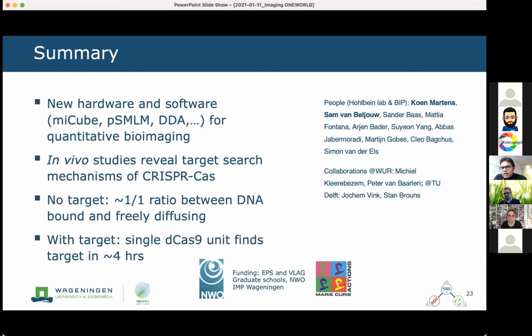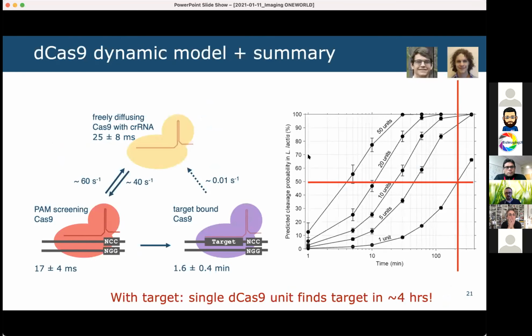Kevin Wheatley asked: you described the kinetics of dCas9 for catalytically active Cas9. Is the unbinding rate similar to post-cleavage? Does this depend on the length of the target strand? That I don't really know. So let's go back. This is a hypothetical one where we just said, let's assume as soon as it's found the target, it can cleave. Cleavage will also take a while. I don't know currently how long that will take. But if we provide the possibility to cleave, then we would start cutting our DNA into pieces in the cell. That's very difficult because all those measurements are pretty much done under equilibrium conditions, whereas if you start cutting, you would leave the equilibrium conditions. It would be a very nice experiment though.